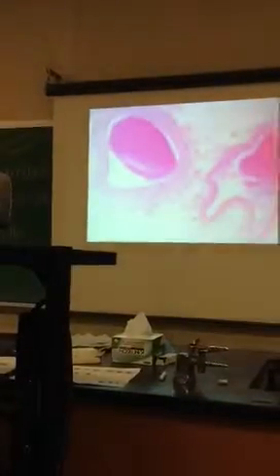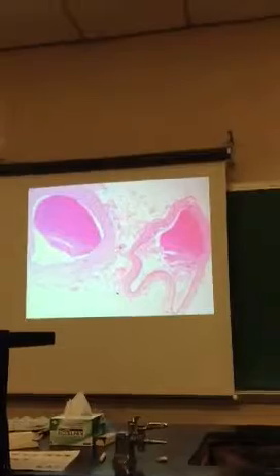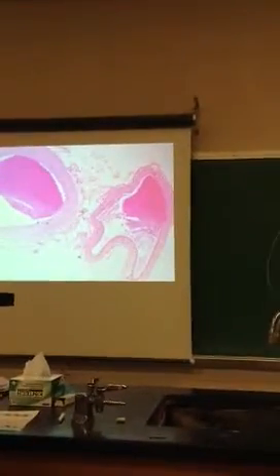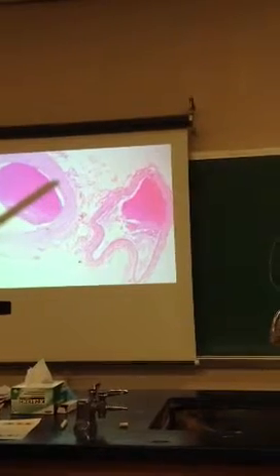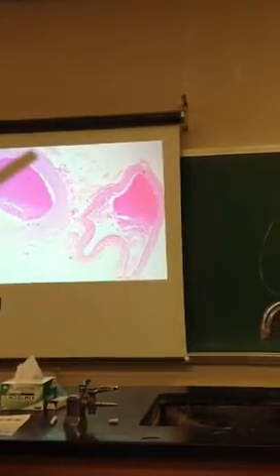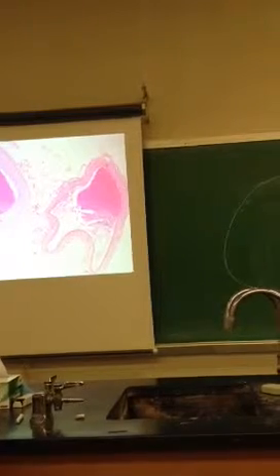Skeletal muscle reminds me of a steak. What's on the left? Artery. Right? Vein. This layer right here, tunica intima. This layer right there, tunica media. This layer right out here, tunica externa. This is a vein.